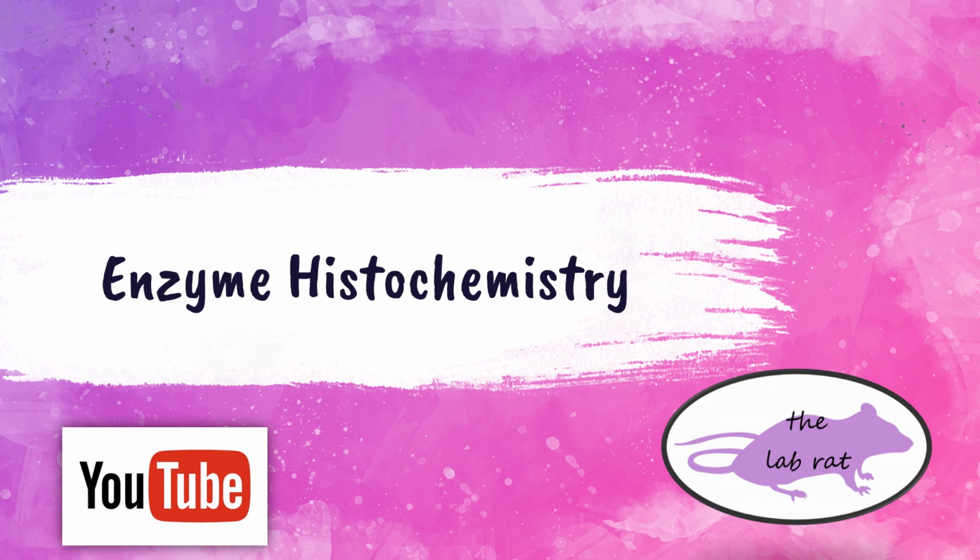In this video, I'm going to be discussing enzyme histochemistry and its uses in the histology laboratory. All right, let's get started.